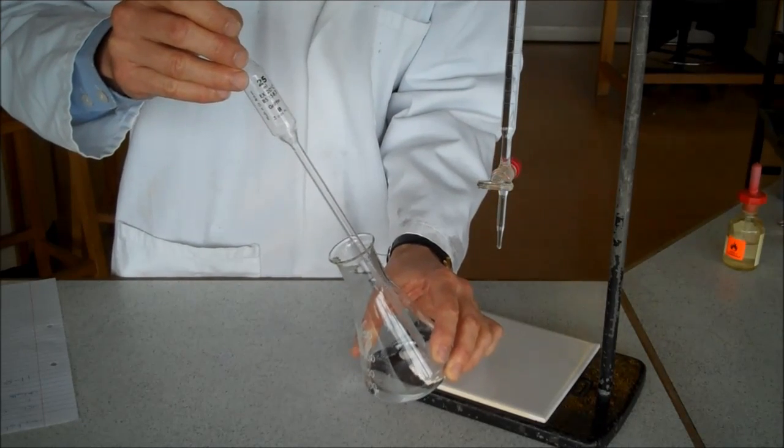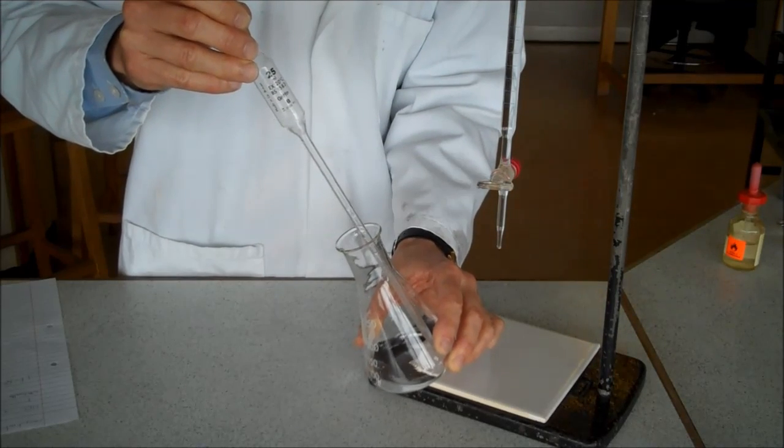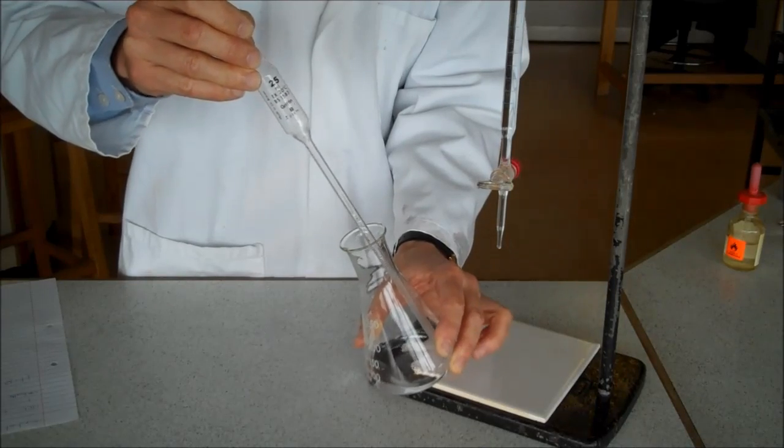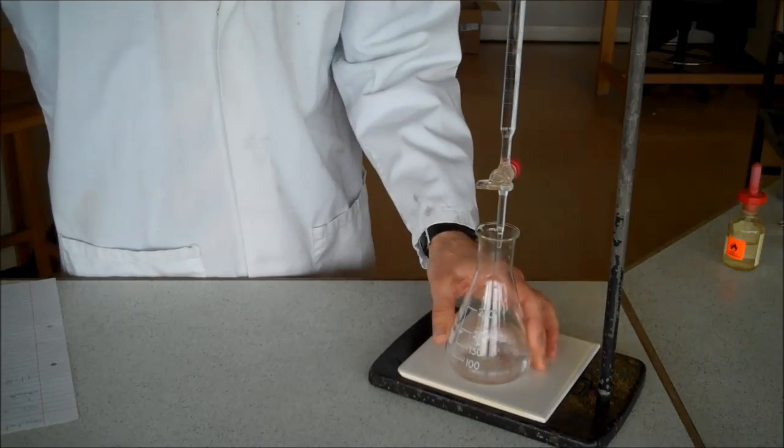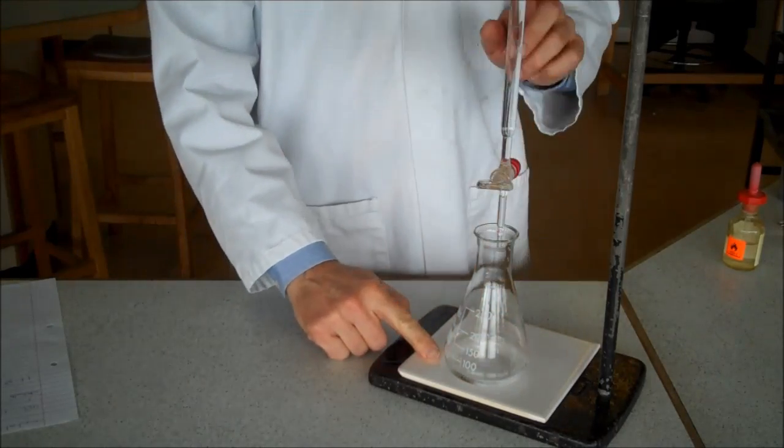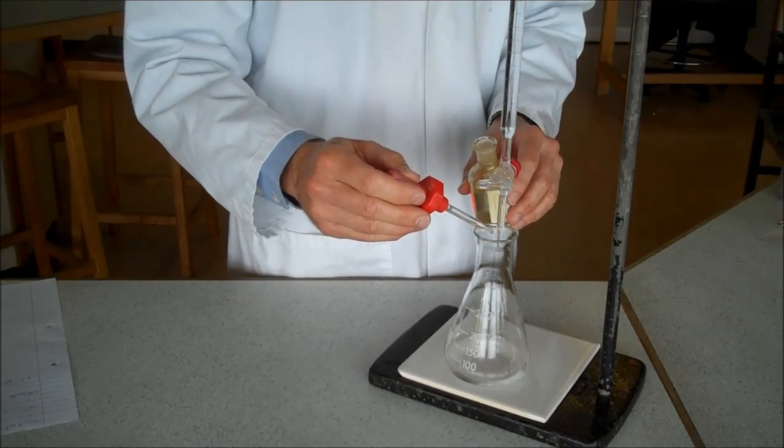Likewise, the burette is by far the best apparatus for adding our other chemical, in this case hydrochloric acid. Okay, so I've got alkali, acid in burette. Again, I need to use my indicator, phenolphthalein, 1, 2, 3, 4, 5.